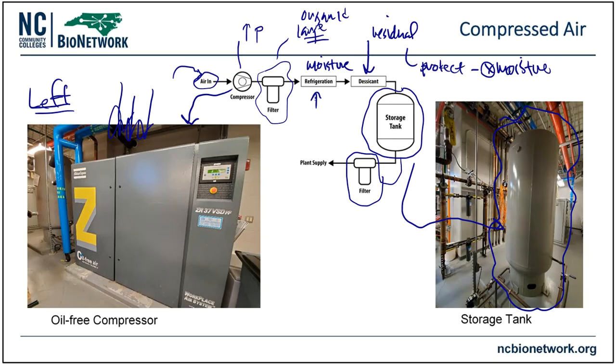As you can imagine, these filters will have visual indicators on them most of the time, and those visual indicators will let you know: are those still working the proper way? Is it time to change those? Is it time to update them? Do I need to replace cartridges and so forth? Over a course of time, they do get spent. They do need to be replaced, and somebody's got to do that job. So there are often visual indicators on there for that reason.